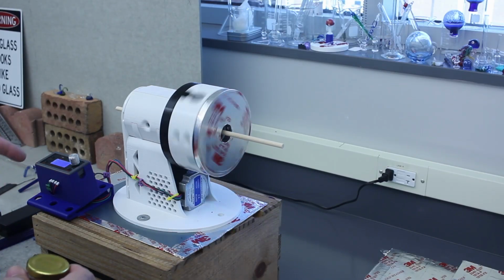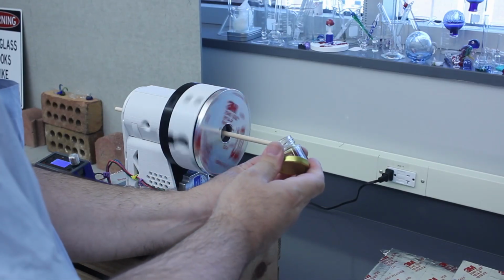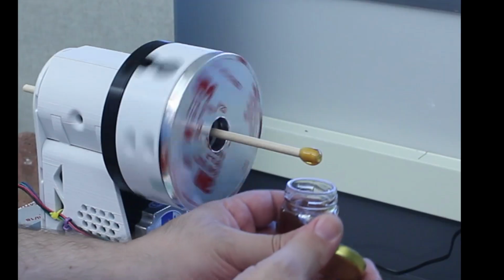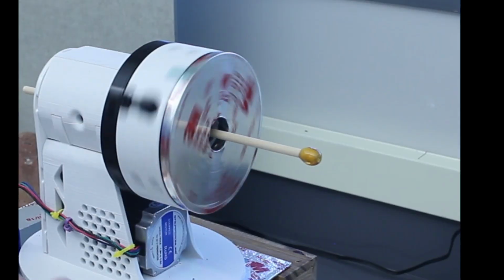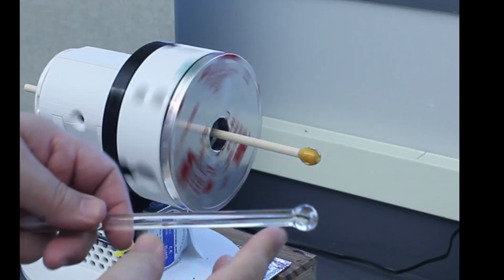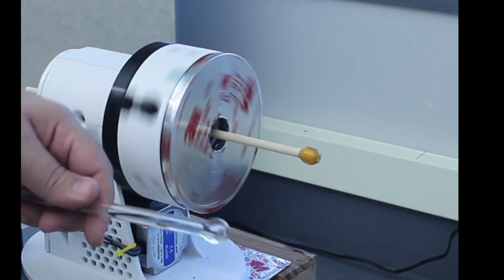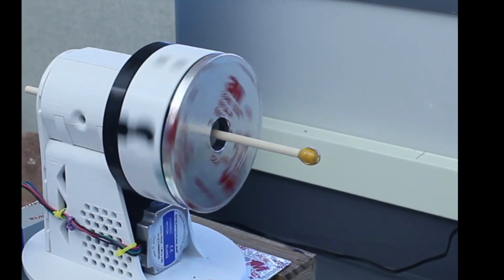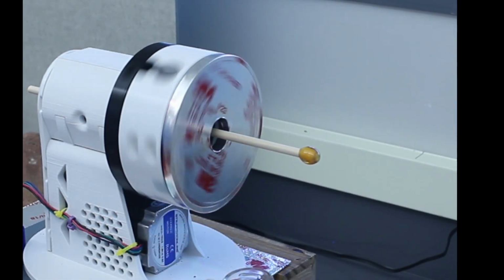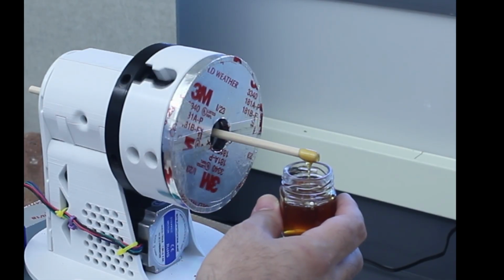The power setting on the controller is 250. I'm going to come in here, put a little bit of honey on the end, and now I have a gather, right? And as strange as that might seem, this ball of glass that I heated up, while it's molten, will behave just like the honey. If you stop rotating, well, there it goes. It droops and then eventually drips off, right?